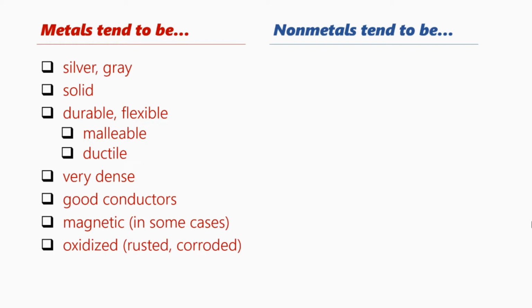Okay. Now, in addition to that, metals also tend to be lustrous. Okay, so aside from being oxidized, typically they tend to have a shininess to them, a luster. So if you have something that has a very nice shiny reflective surface, that could be a sign that you're dealing with a metal. And if you have a metal that is oxidizing, then sometimes it's harder to see that. It kind of dulls the surface.